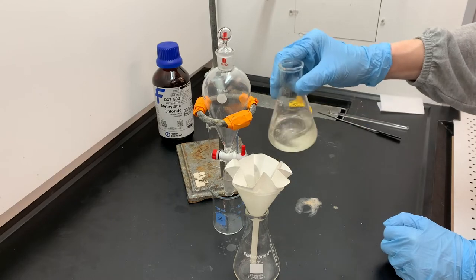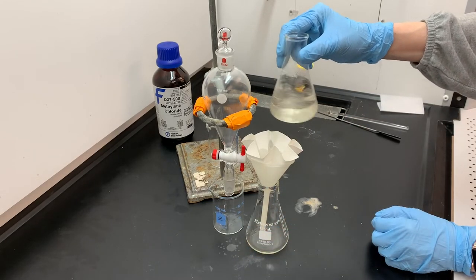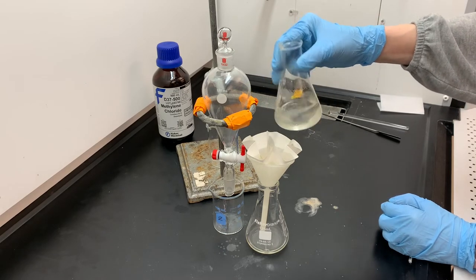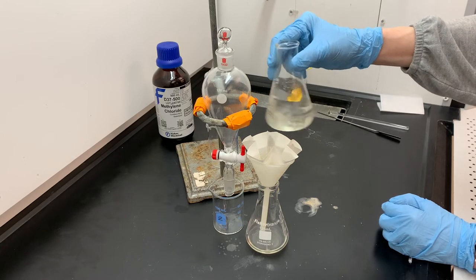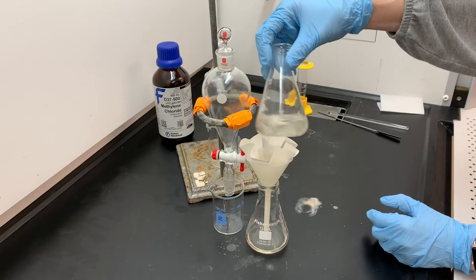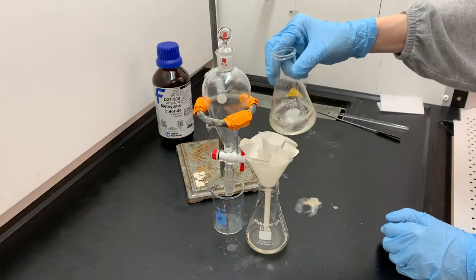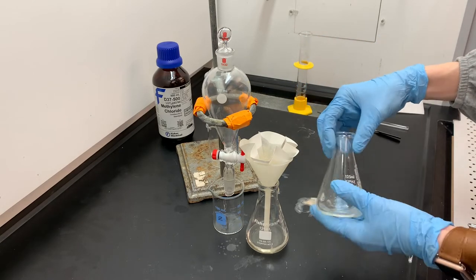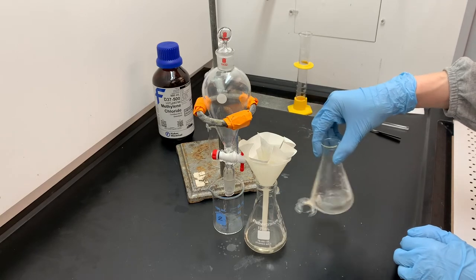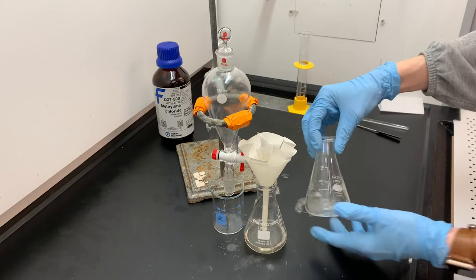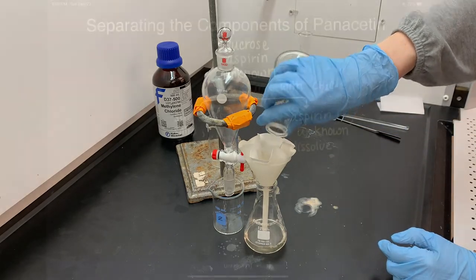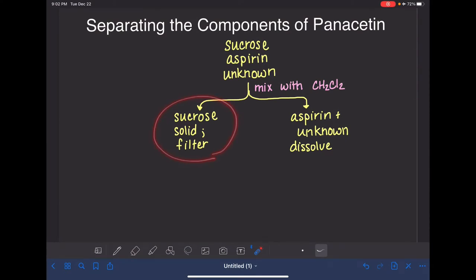It's going to take a few pours before I get everything transferred out, so I'm constantly swirling and stirring the solution to keep the sucrose from settling or sticking to the Erlenmeyer flask. Once all the solution is transferred into the filter paper, we'll wait for the methylene chloride solution to finish draining, then take the filter paper, set it aside, and let it dry overnight. We'll come back the next day to weigh it and get the mass of the sucrose we filtered out. Now we'll focus on separating the aspirin and the unknown from each other.